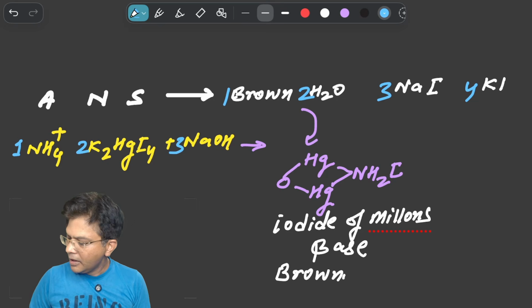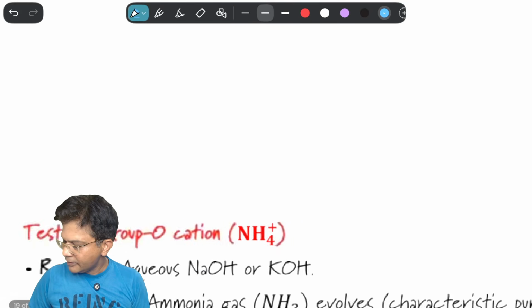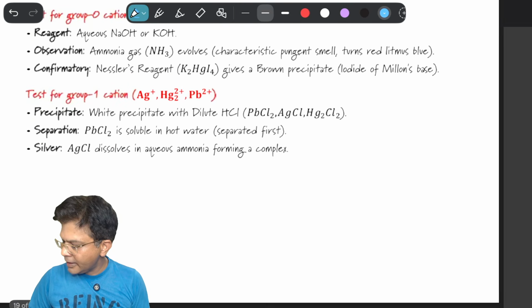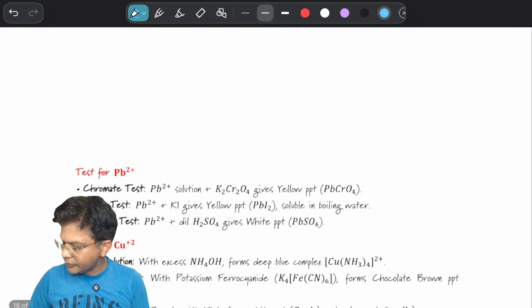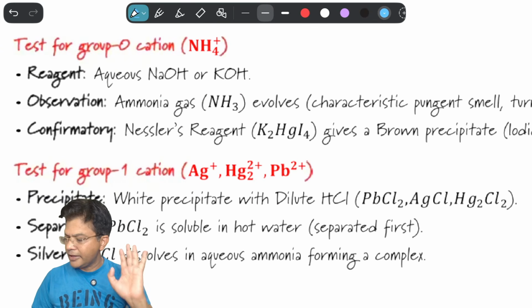Okay, now let me go back to where I was. I was over here, the ammonium radical test, and Nessler's reagent test we have done.